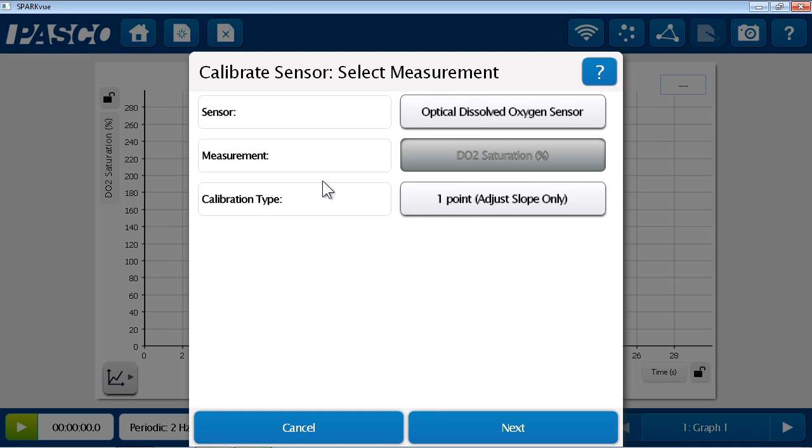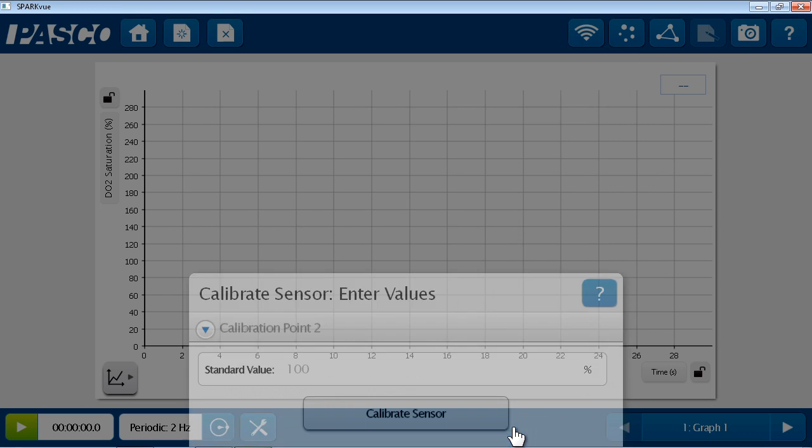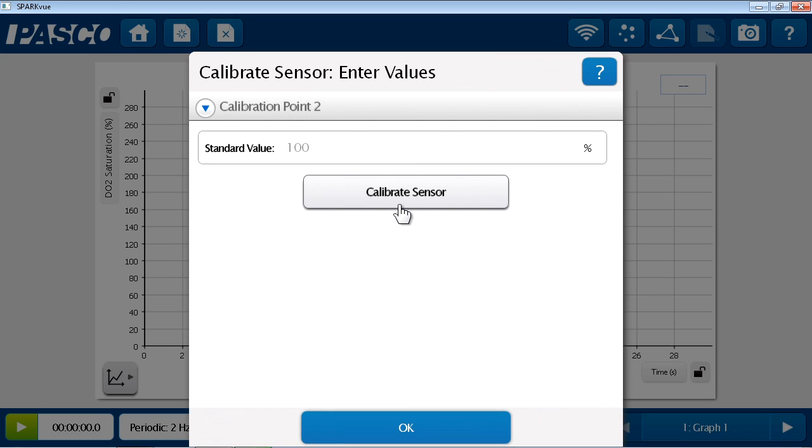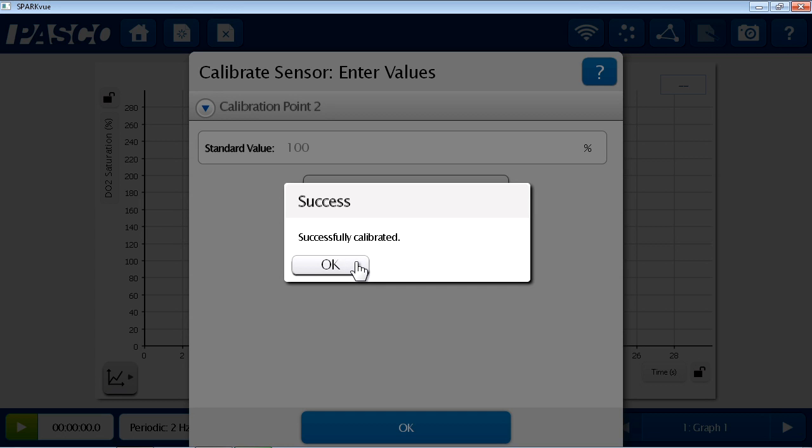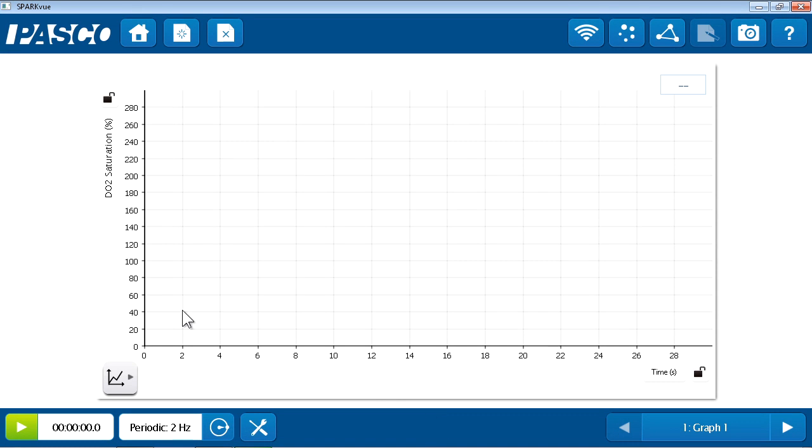Make sure the Optical Dissolved Oxygen Sensor and the Percent Saturation Measurements are selected. They are by default in this case because I only have one sensor plugged in. Proceed to Next, and then select Calibrate Sensor. The sensor has now been calibrated and this value is stored in the sensor. We can now exit the menu and proceed with our experiment.